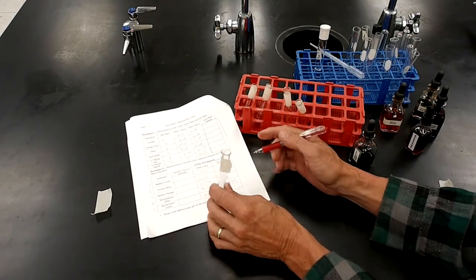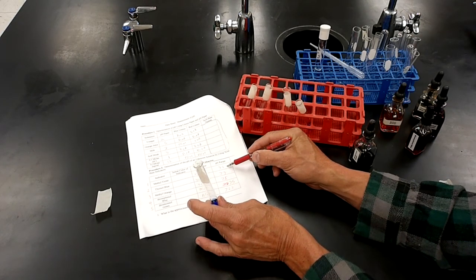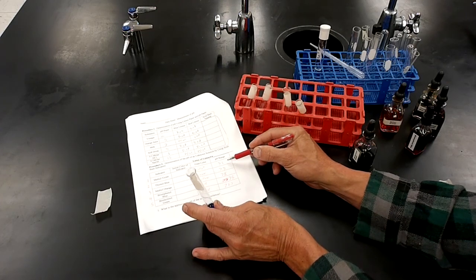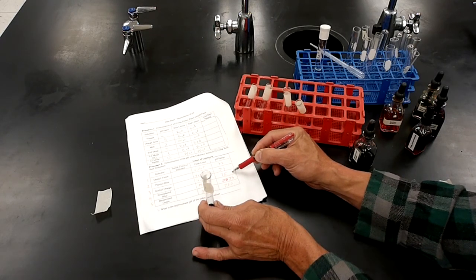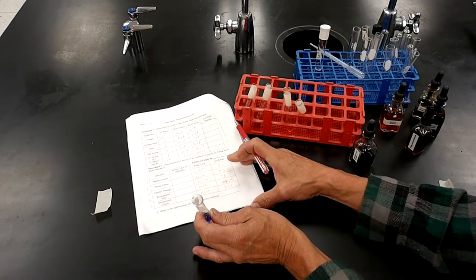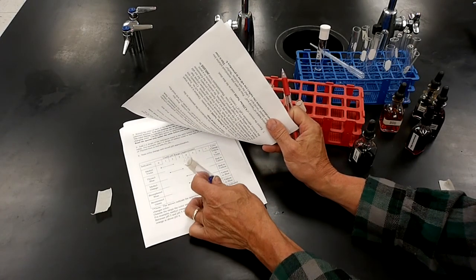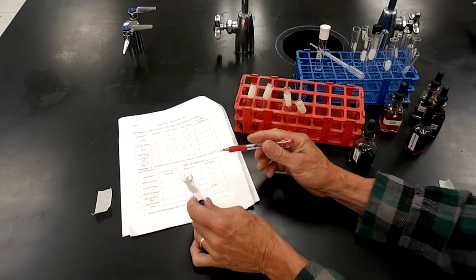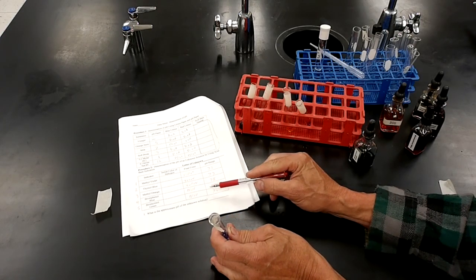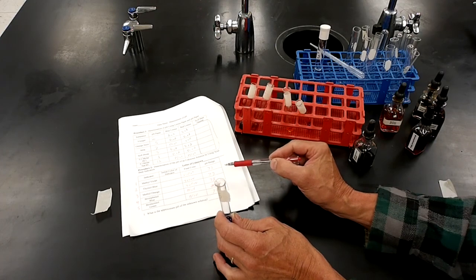All right, so those are my pHs with the various pH indicators. I know violet is greater than 2, thymol blue is greater than 3, methyl orange is greater than 5, bromphenol blue is greater than 5, bromcresol green looks like it was better than 6.5. It's about in the middle. So what you have to do, this is the part you'll have to answer, it's not very difficult. What should be the pH of this solution?